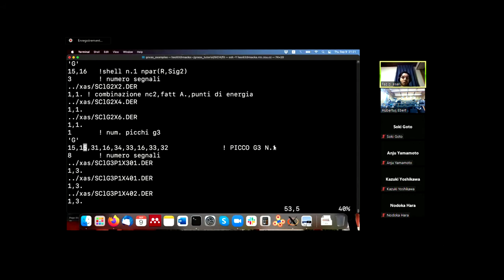And also in this case, another useful property of this program is that because our R1 and R2 in the three-body configuration are the same as in the two-body, because it's the silicon and chlorine distance, we can use the same parameter.